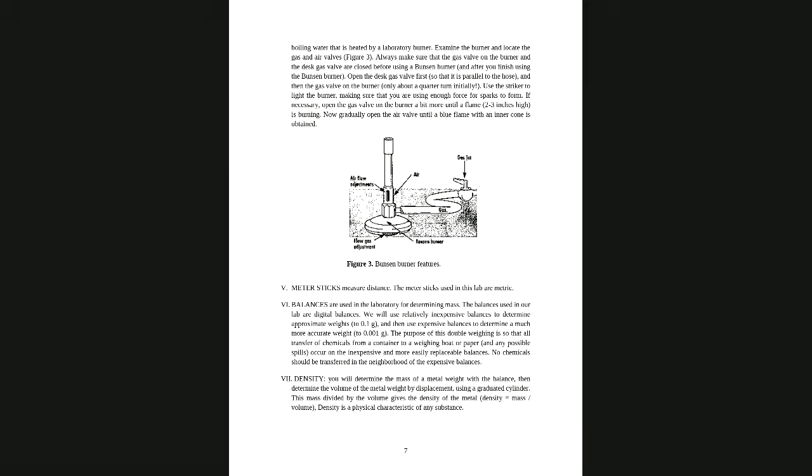Balances would measure the mass, and based on the accuracy of the balance, you would see 1, 2, 3, or 4 decimal places, and you have to record all those numbers. Whatever you see on the scale, you would record.